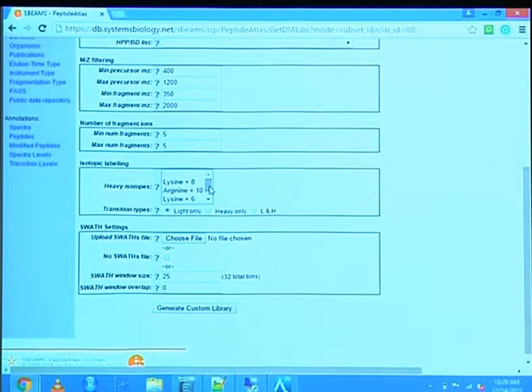We purposely did not add the tags, since they modify the peptide sequence, so the retention time is different, as well as the fragmentation. We just don't think it's a good idea to do that at this stage. We first have to see how different they are, so that people don't say, hey, I've done it, and then the library is bad.